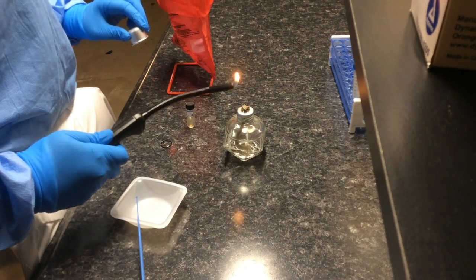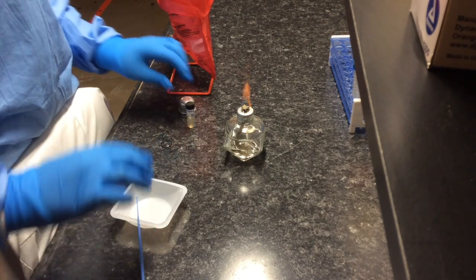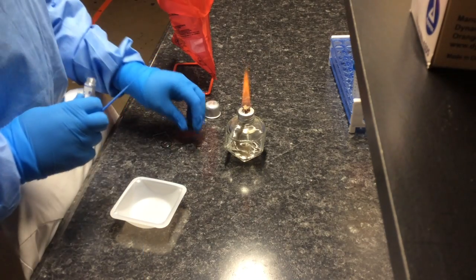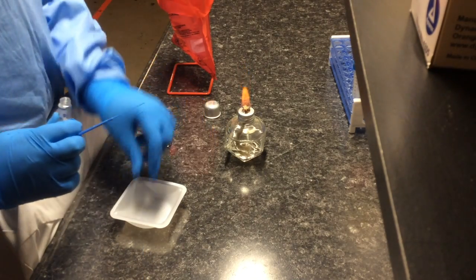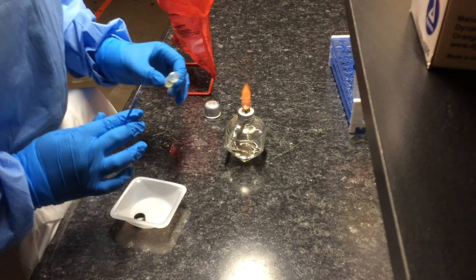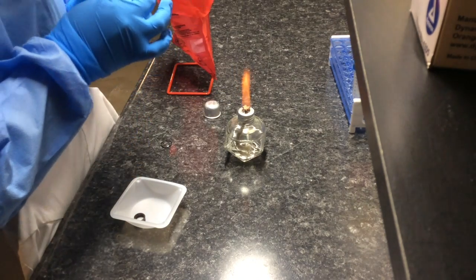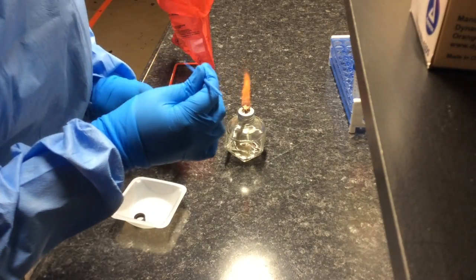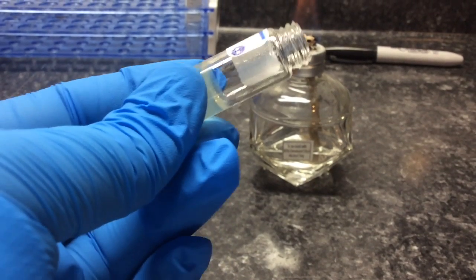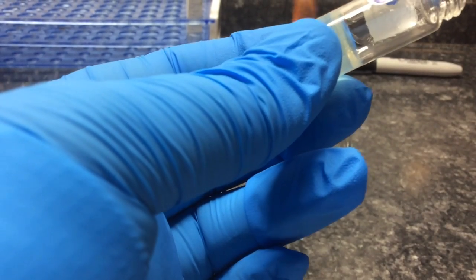At this point you want everything to be sterile, so turn on your flame. The next thing you want to do is open your tube of bacteria. Take your vial and flame it, then take your inoculation loop and place it in the hole already created from the stab.